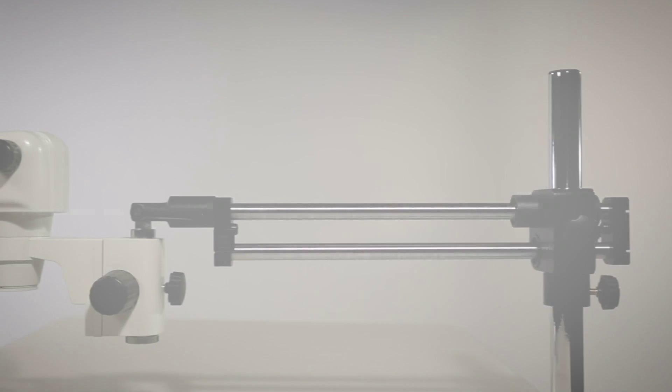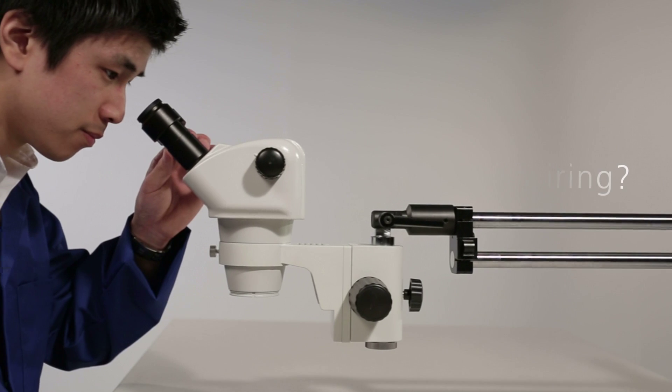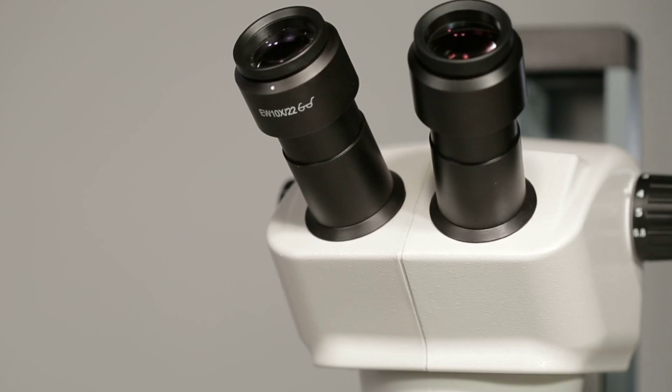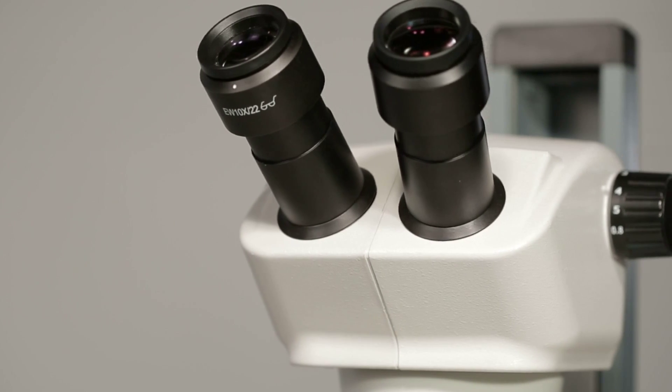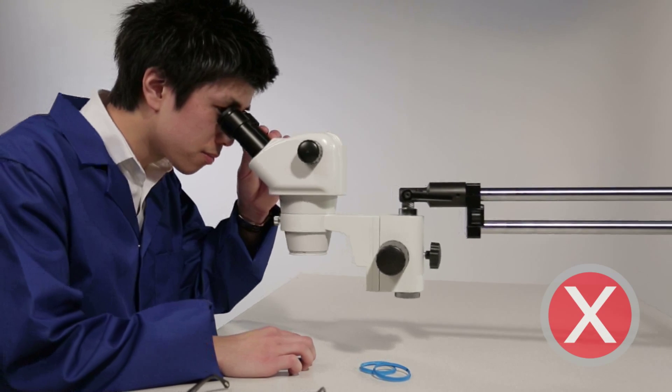Have you ever wondered why microscopes are so tiring, so difficult to use and set up? Microscope eyepieces restrict movement, require precise alignment of your eyes and are not ergonomic.